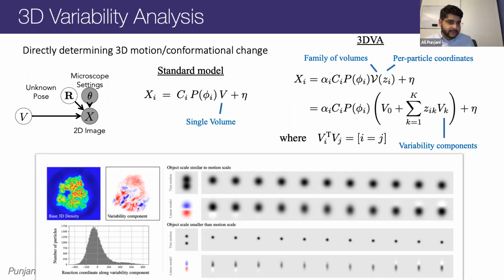And if you solve it with 6 variability components, you'll get the same first 3 and 3 more in their order of importance. That's an important property, and that's helpful because you don't really have to guess how many there are. You can just solve as many as possible and you'll always get the most important ones present.